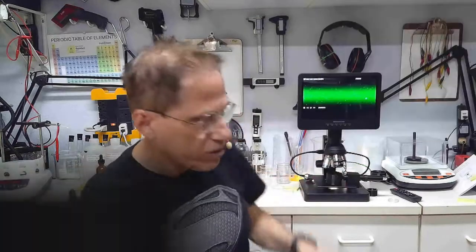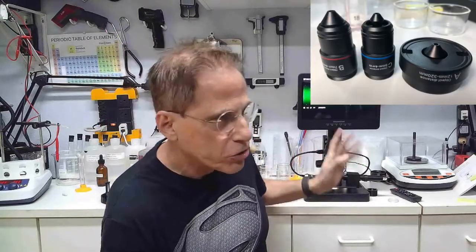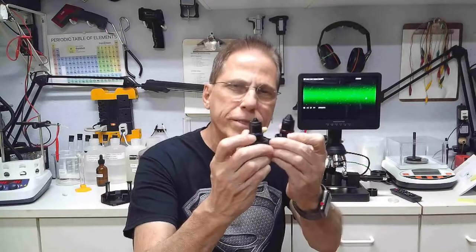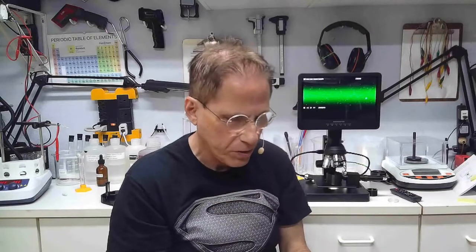I've covered all the lenses and figured out that the lenses it came with — three if you count the single lens — that single lens is a 4x, which for most purposes is not very useful because you have to remove the whole assembly to put it in. The other two included lenses: the red one, rated at 7-8mm, turns out to be a 10x lens, and the one with the blue line, a 3-4mm distance lens, turns out to be a 20x lens.